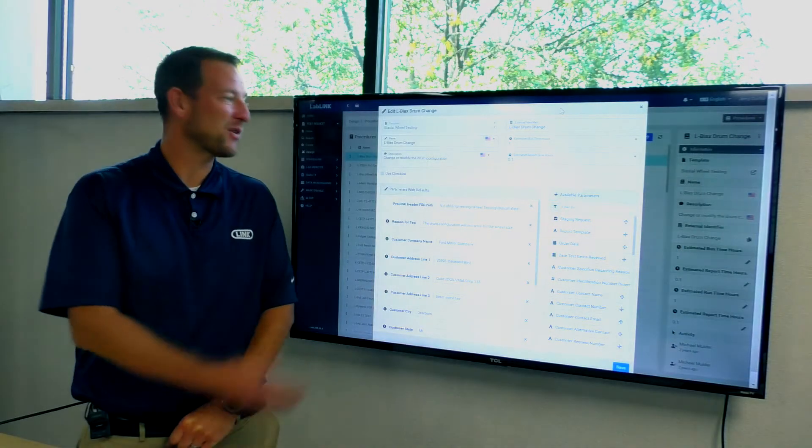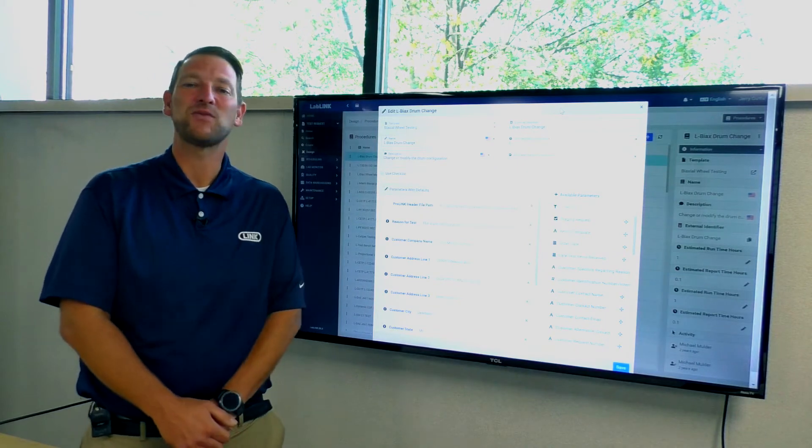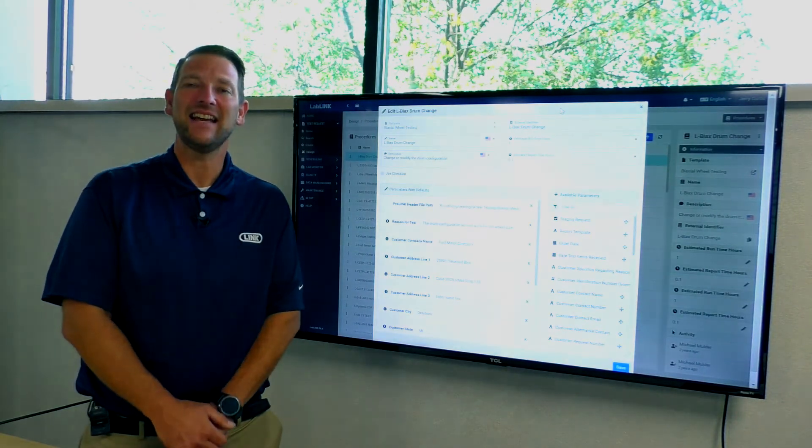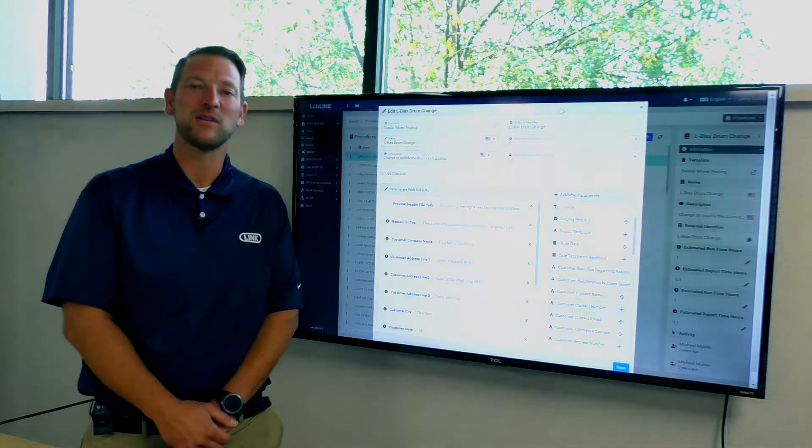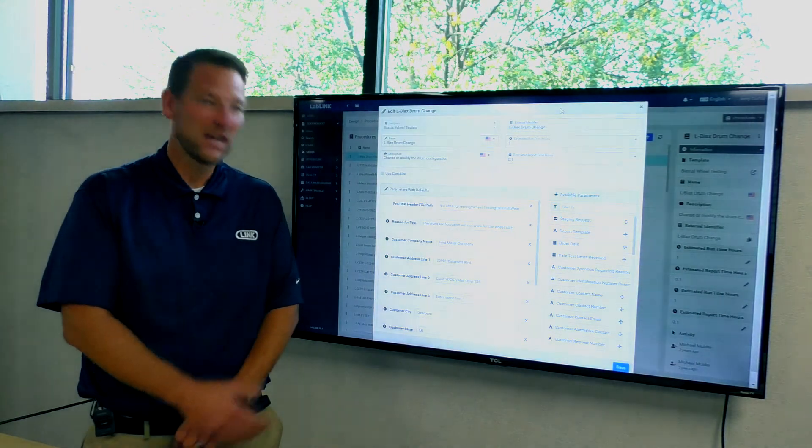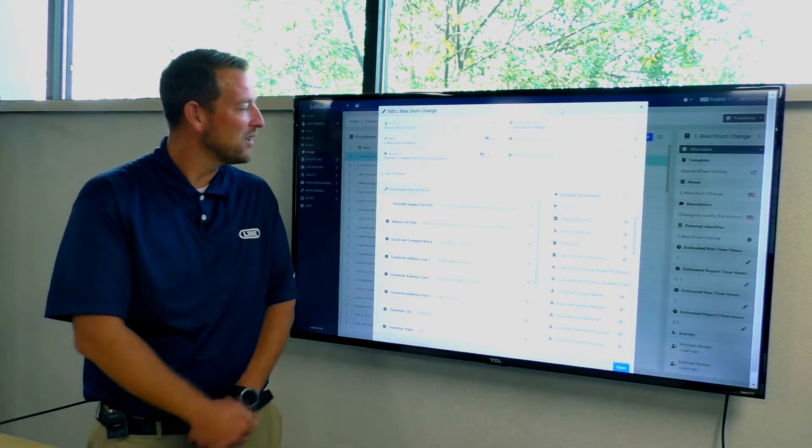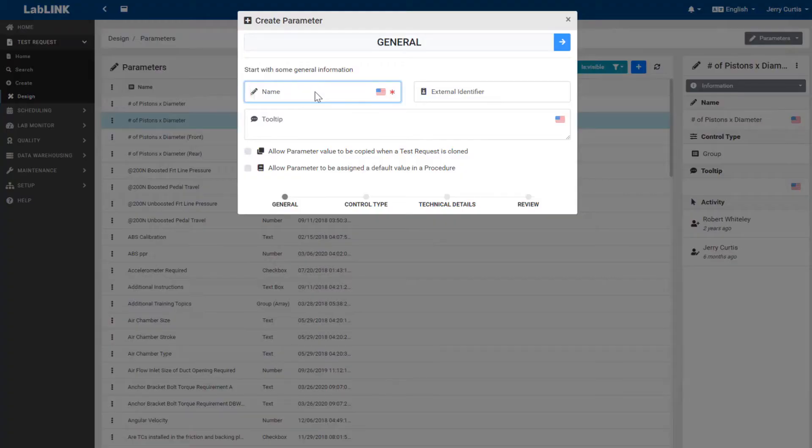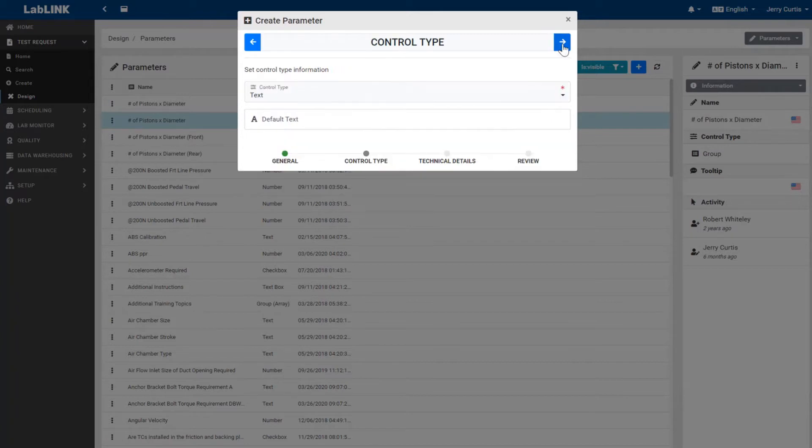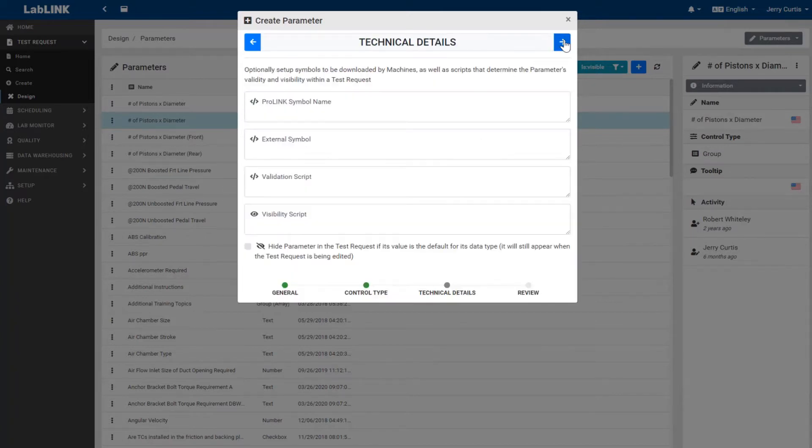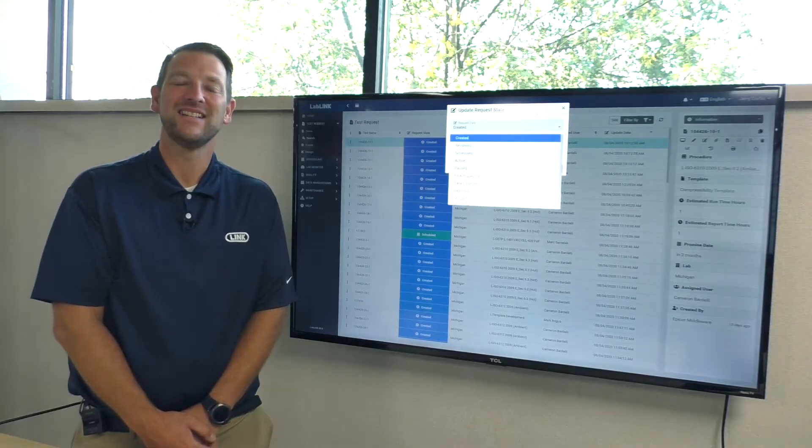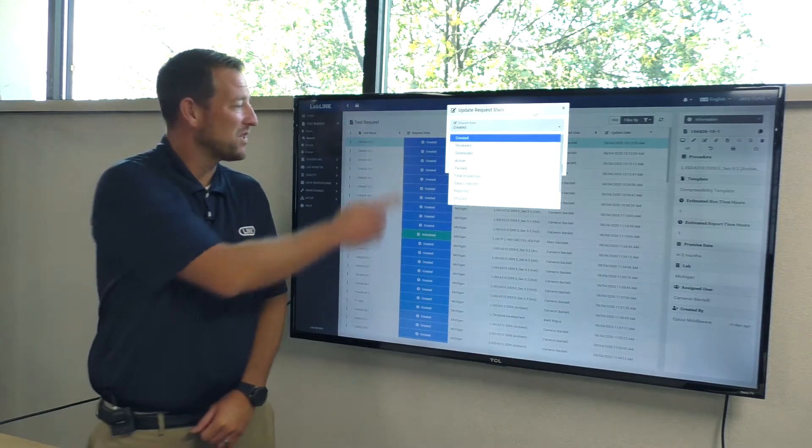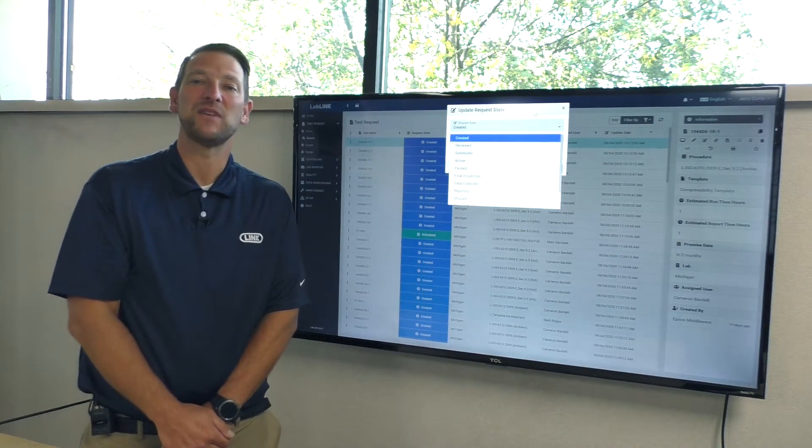LabLink's test request module allows for easy and intuitive design with no coding required. With test request, you can create an unlimited range of personalized templates that can be controlled and deployed throughout your entire organization. Additionally, test request states can trigger automatic notifications.